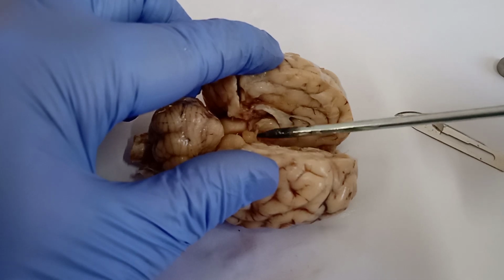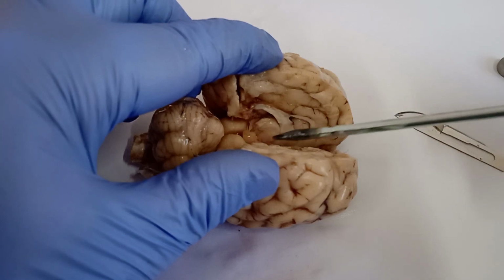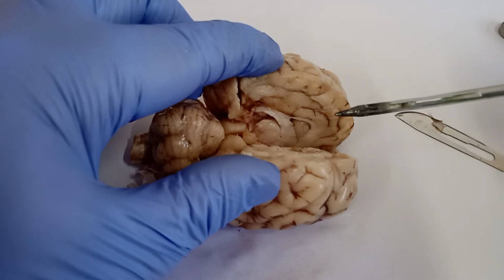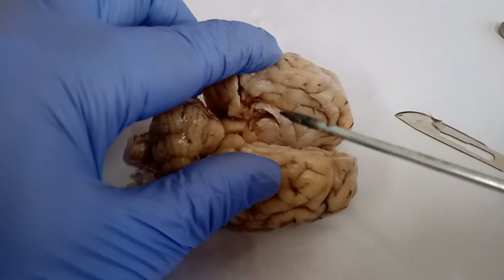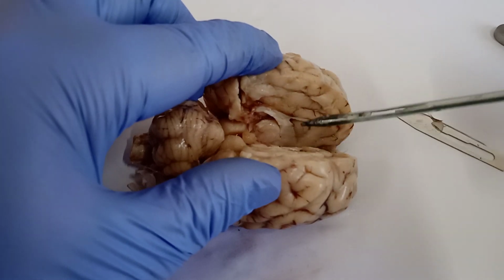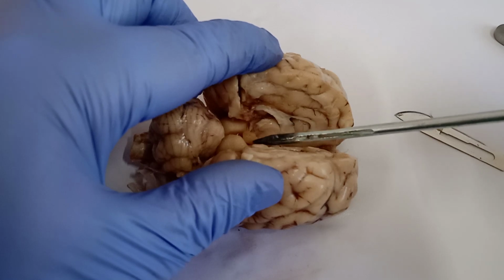The other name of the pineal gland is epiphysis cerebri, because one more gland will be on the downside on the ventral aspect, that is called hypophysis cerebri or pituitary gland. And this white area was basically the corpus callosum that connects these two cerebral hemispheres. So this is the pineal gland, if you clearly see.